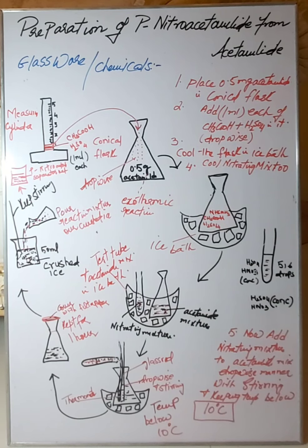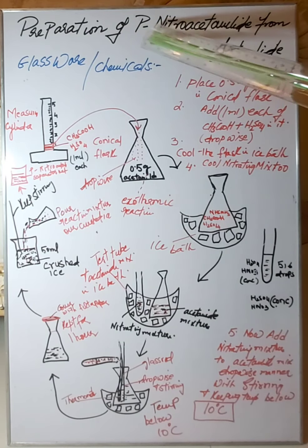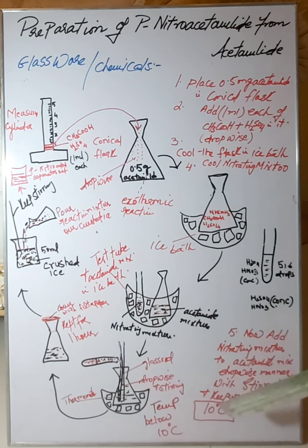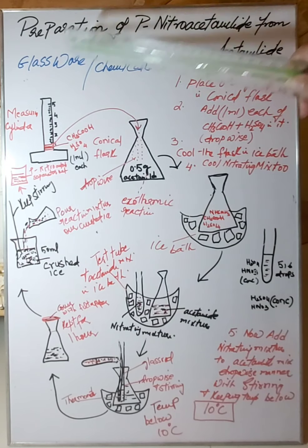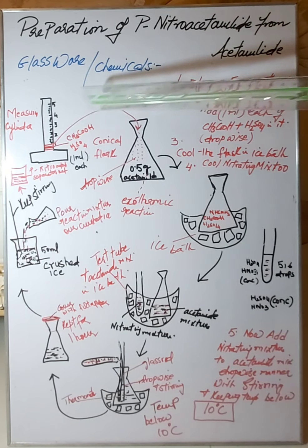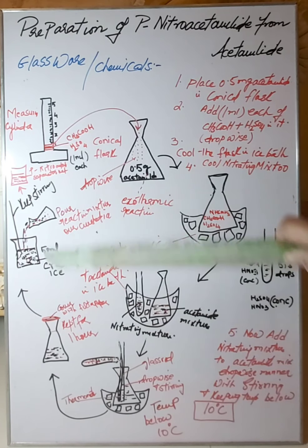So in this way, you are going to prepare nitroacetanilide from acetanilide. These are the whole series of steps you are supposed to follow to get this amazing product, pale yellow crystals of nitroacetanilide, and you will get the product only when you follow all these steps as I just mentioned.